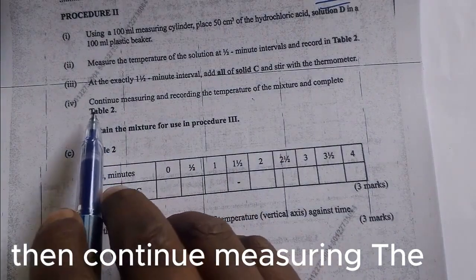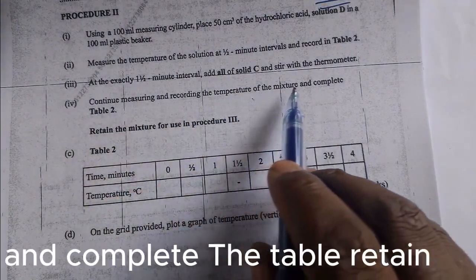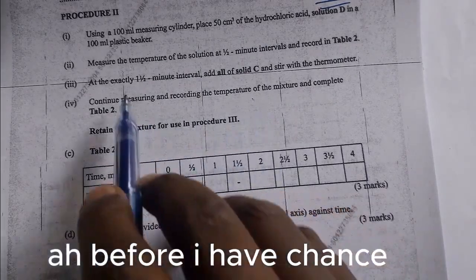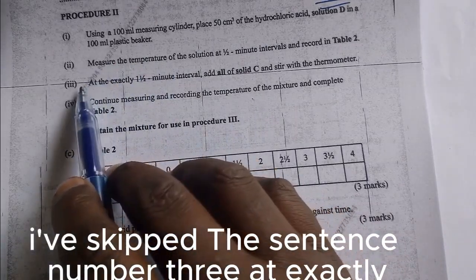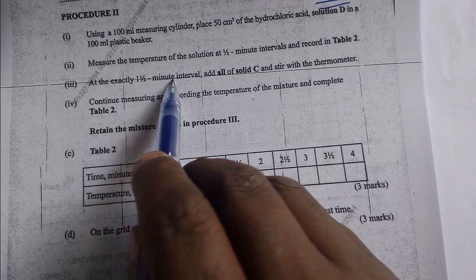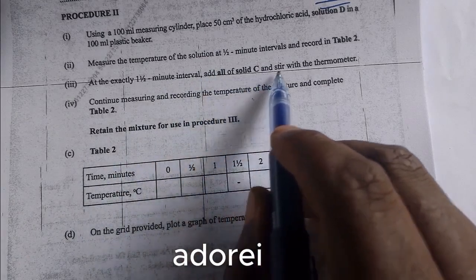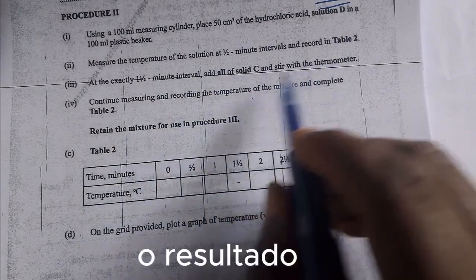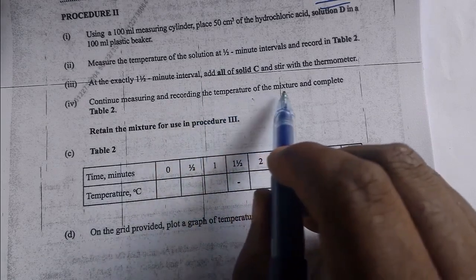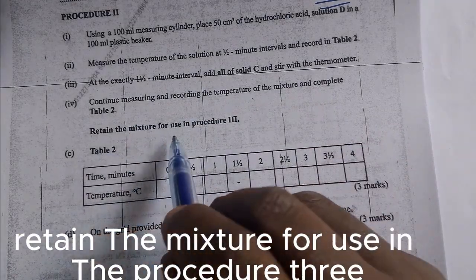Then continue measuring and recording the temperature of the mixture and complete the table. Before, I skipped this Roman 3. At exactly 1.5 minute interval, add all solid C and stir with a thermometer. Continue measuring and recording the temperature of the mixture and complete the table. Retain the mixture for use in procedure 3.